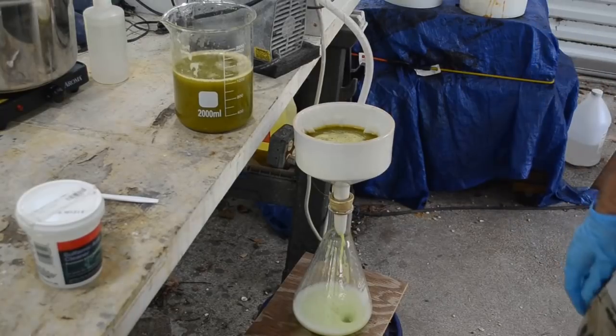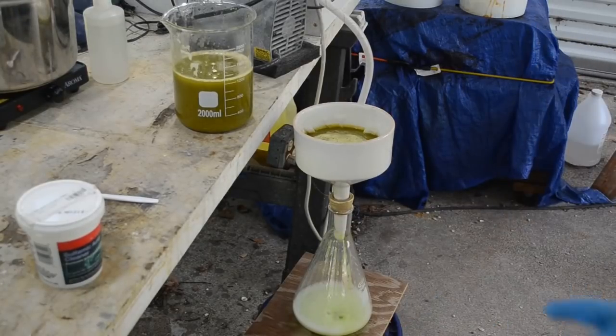And obviously, the liquid's still pretty gassy. Got all that foam down there, probably from when I denoxed it with the sulfamic acid. It produces nitrous oxide as a byproduct. So nitrous oxide coming out of solution in a partial vacuum in the receiving flask there.